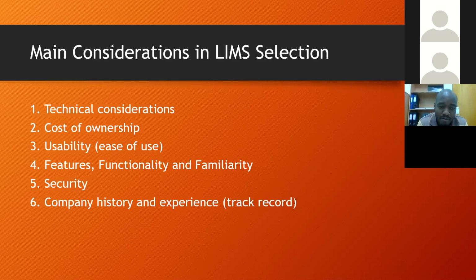Please continue. So there are technical considerations to look at. There is cost of ownership, whether it is going to be your own application or you're just going to use it on a lease model. And usability. This is also very important because the end users are the ones who use the application day to day.